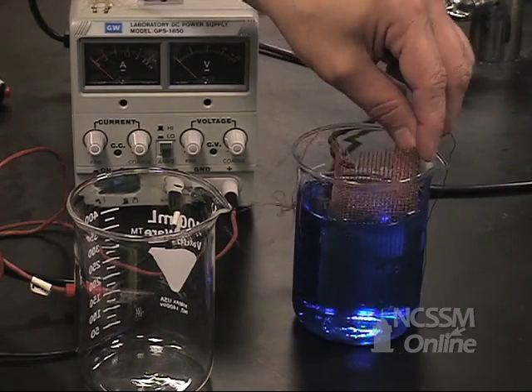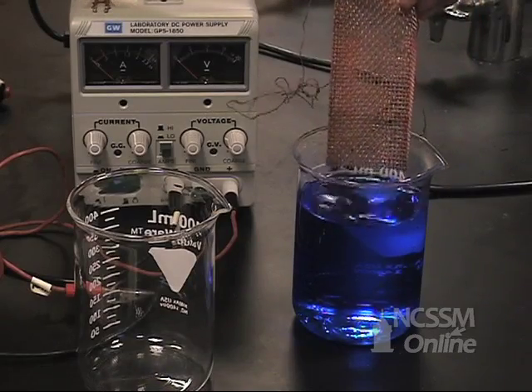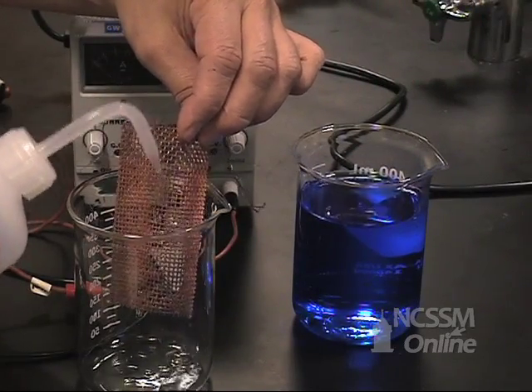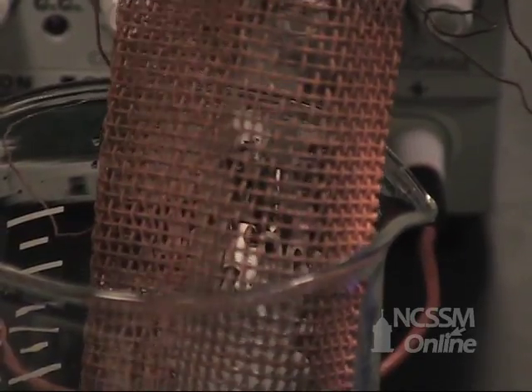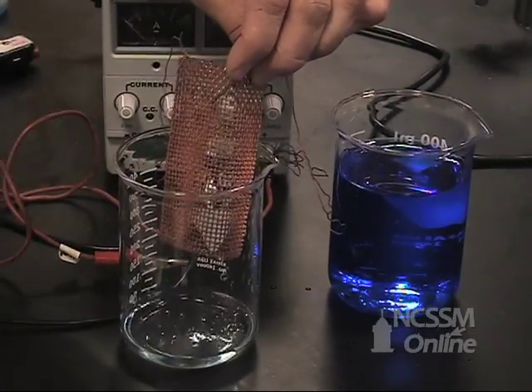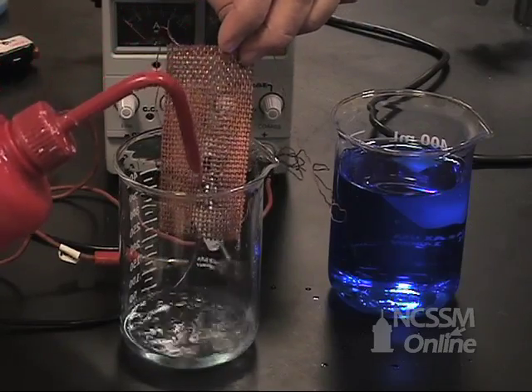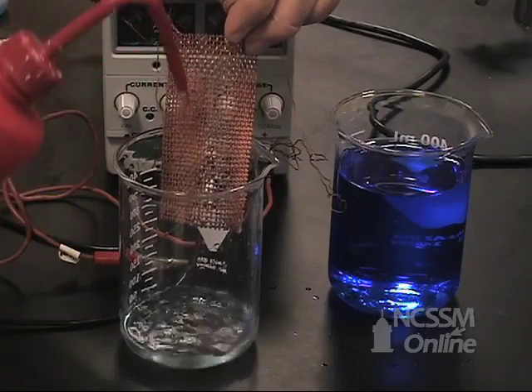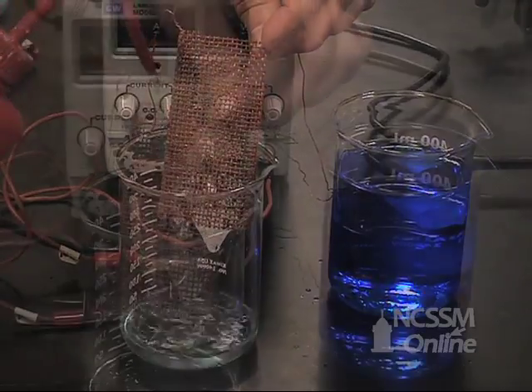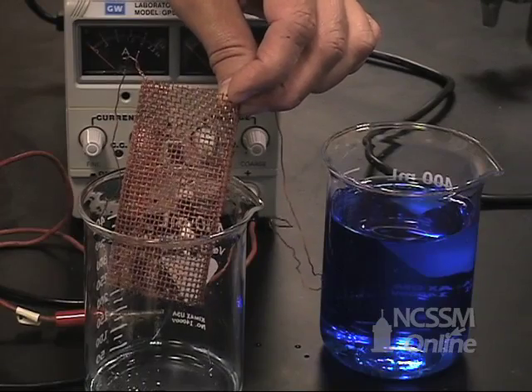We'll take the cathode and carefully rinse it with water to remove the copper sulfate solution. We'll then rinse the mesh with a little bit of acetone, which will help to evaporate the water. We'll allow the mesh to dry in the air until it's thoroughly dry.